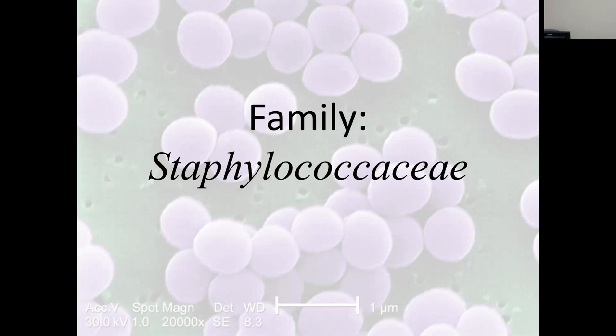Okay. So when we start with staph, next week it's strep. So we'll be talking about how we go from the start of the culture and how we branch off from staph to strep. That's what we're looking at. So your branching tree for microbiology will get bigger and bigger and bigger based on what your culture is doing at the beginning. Okay, so all of our plates we're going to be introducing week after week, we've got to kind of put it together. We can't just forget about it. What we're doing downstairs today and Thursday with staph, we can't forget about that next week when we're on strep, because we're going to talk about how strep is determined based on some tests too.